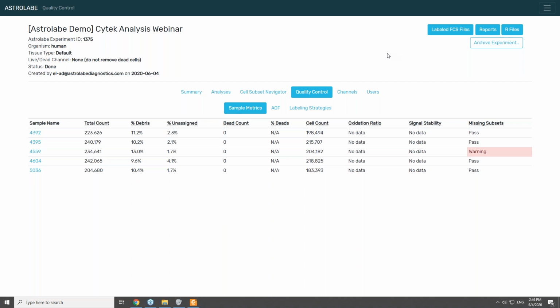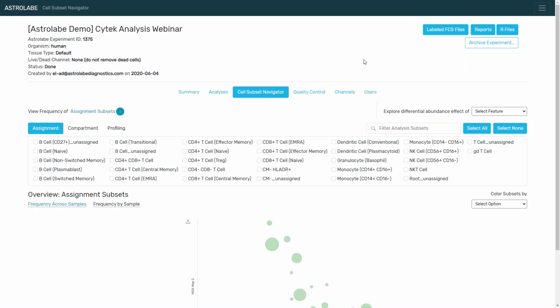Okay, thank you, Elad. Next one, I'm going to read it directly to you. I'm a bit confused about the labeling. How is that done? Do you gate them manually prior to analysis? Do you tell the program to focus on some markers and then you call each phenotype whatever you want, like in t-SNE or FlowSOM?